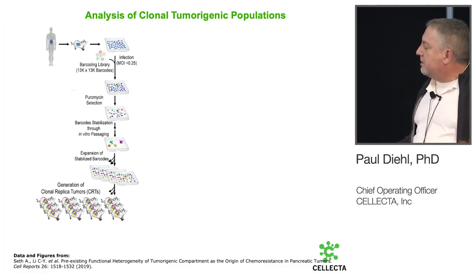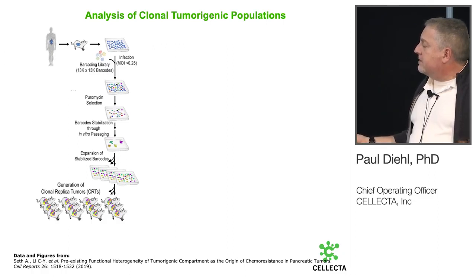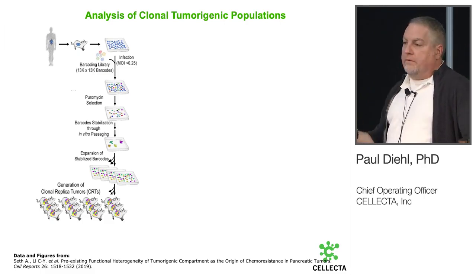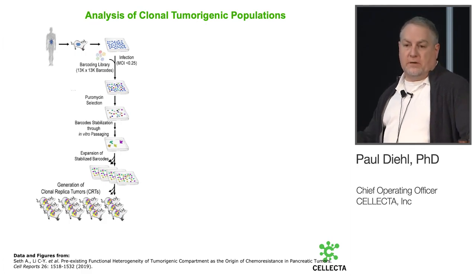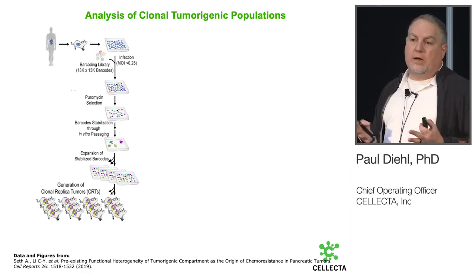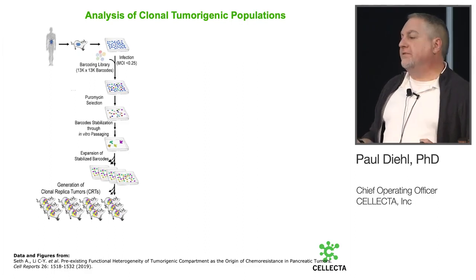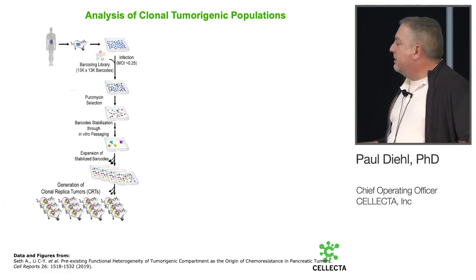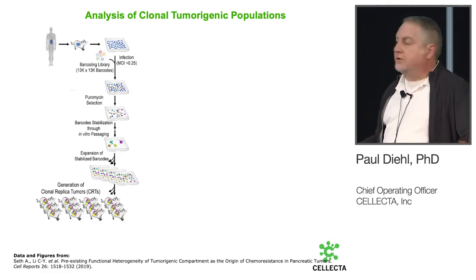This was just published earlier this year by MD Anderson, and this is looking at a PDX model where they've taken cells from the patient, transplanted them in the mouse, and then took them out of the mouse and cultured them. They found that after they labeled them, transduced them with the library, and passaged for quite a few passages, they got a core group of cells with a specific set of barcodes that continued to propagate. They continued to propagate indefinitely, and they put them in the mouse and they continued to propagate.